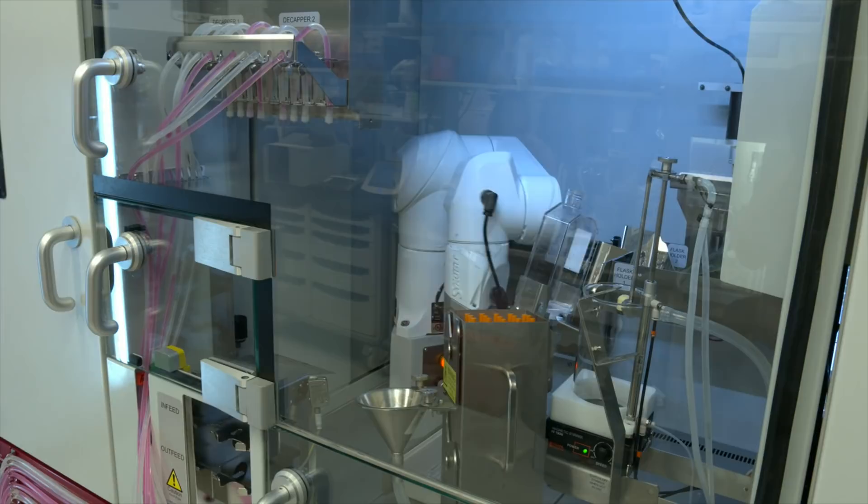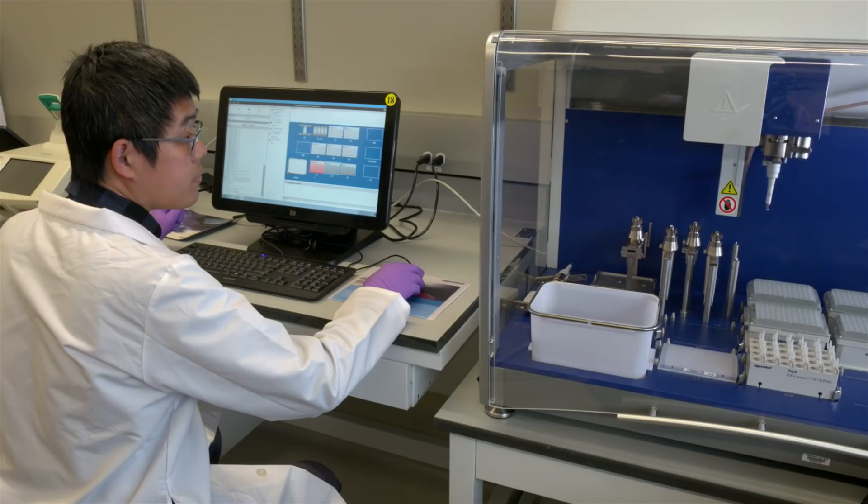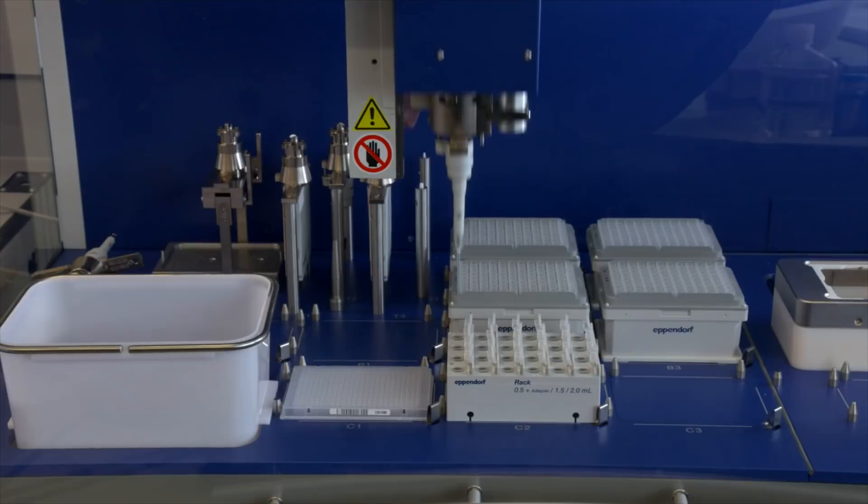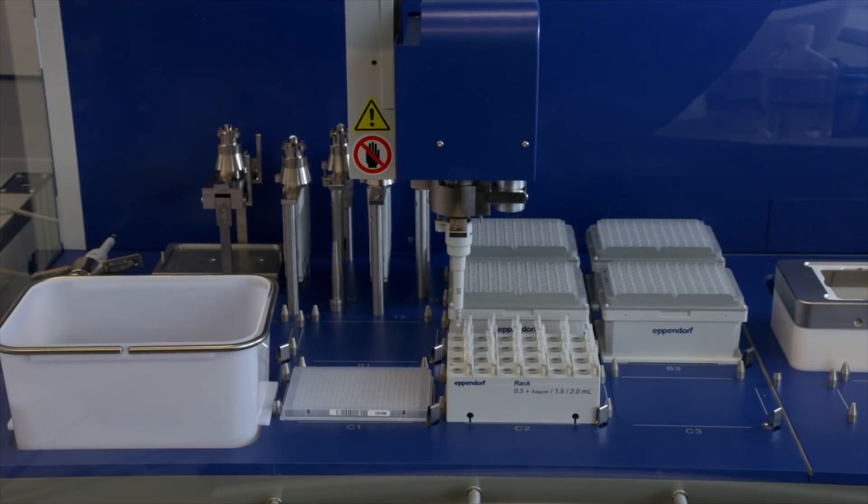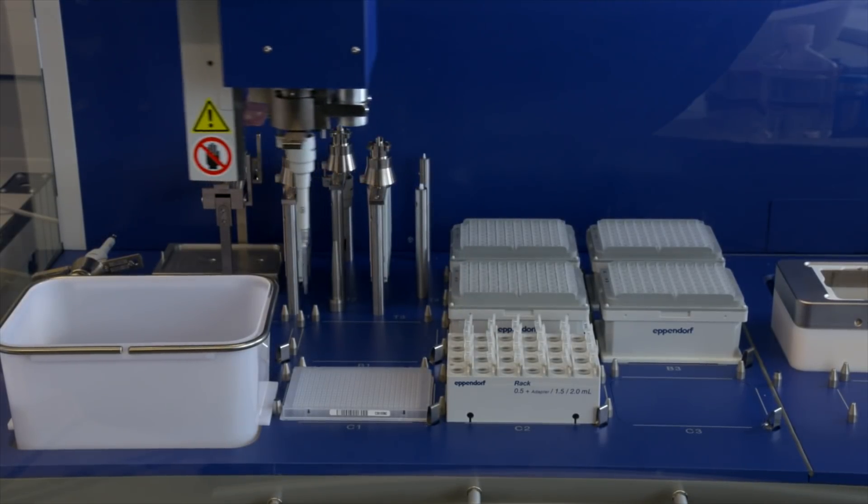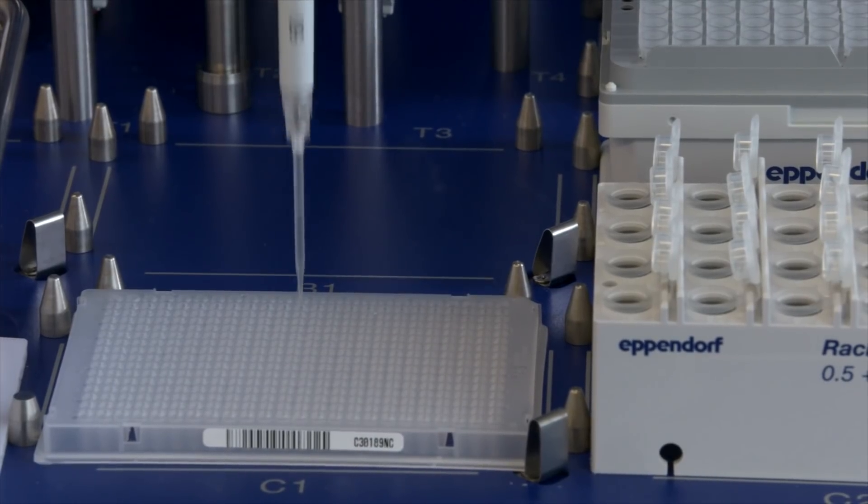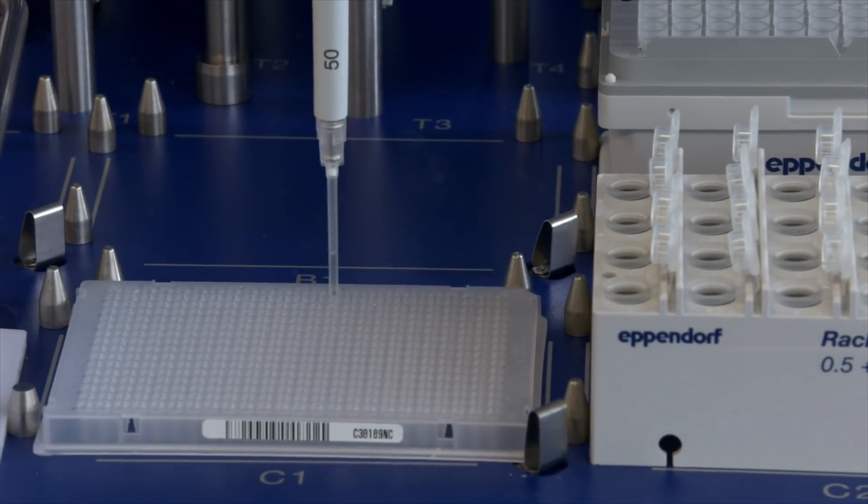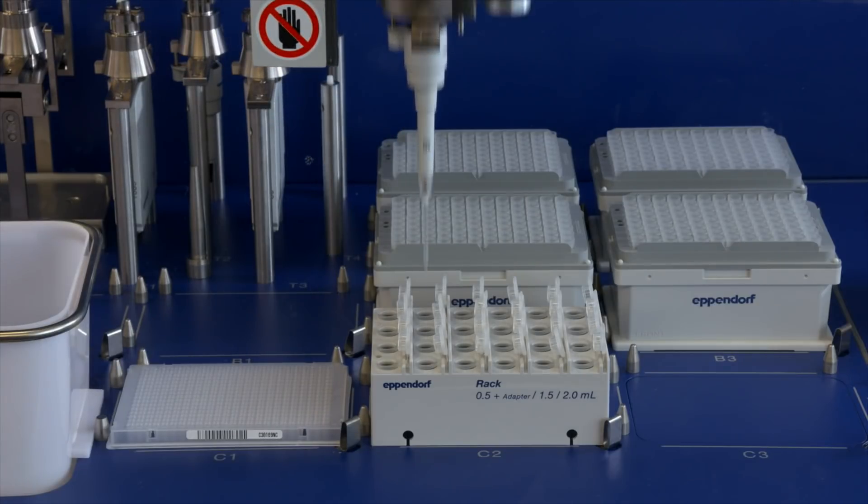By using fully automated methods together with single-cell analysis, researchers can develop new, efficient protocols that can accelerate production and utilization of large numbers of specialized cell types, such as brain cells, liver cells, heart cells, and many others.